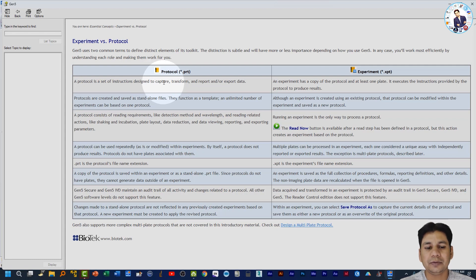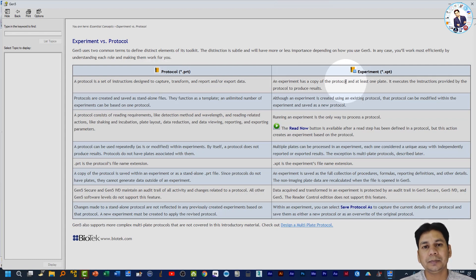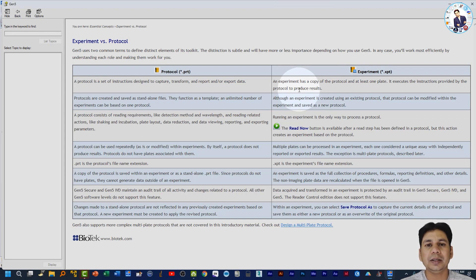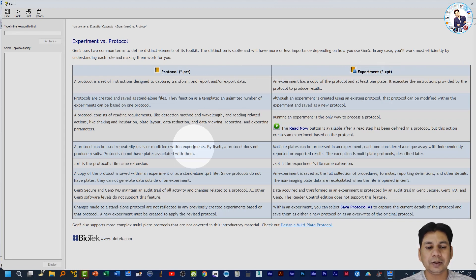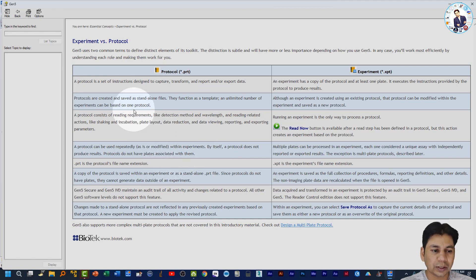The main difference is that a protocol file has no plate attached to the data file, but in the case of an experiment, it has the protocol attached with at least one plate. That is the major difference between the protocol and experiment file. For more detail, you can get information from the Help menu button.